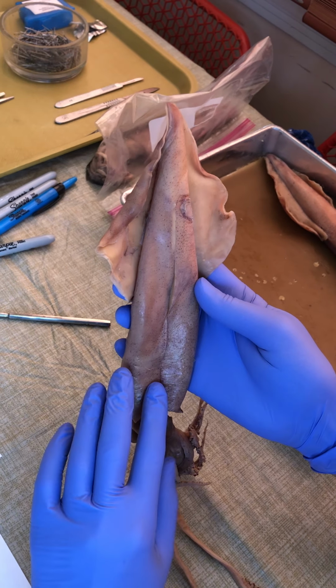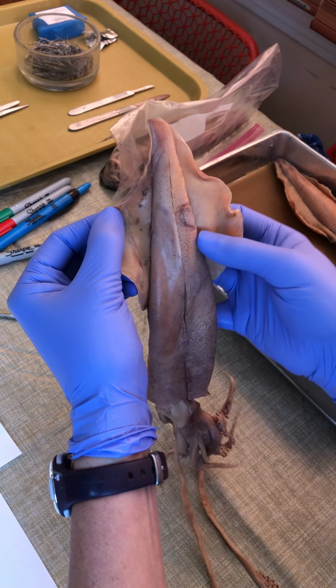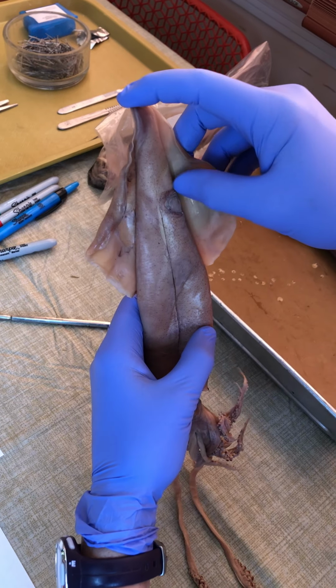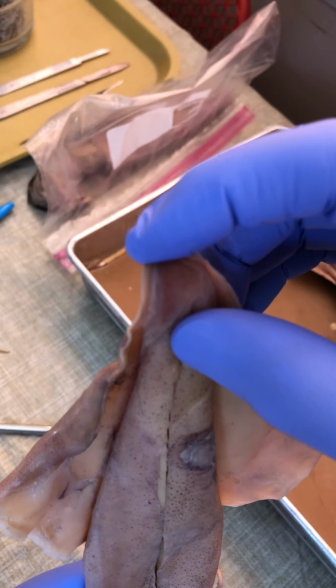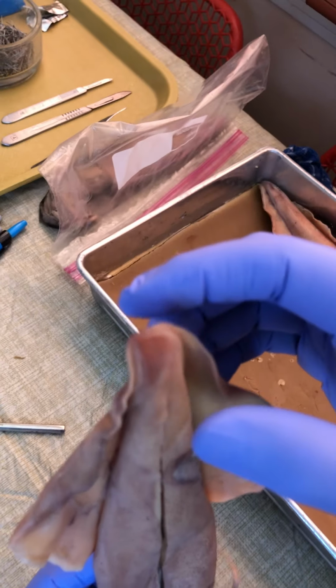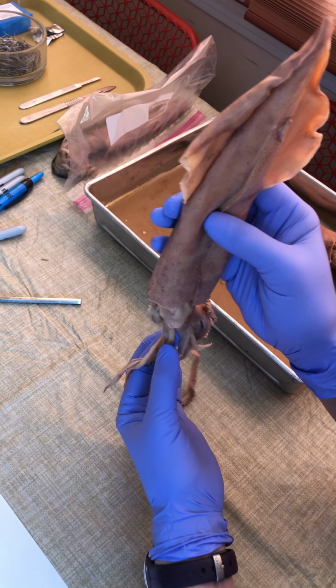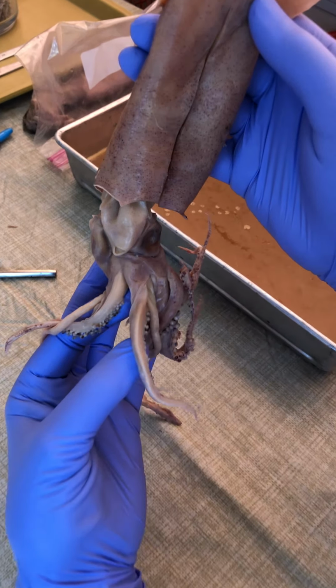So this is an unnatural incision, so just pretend like that's not there. And so this right here, these are the fins, okay? This tip right here is actually the dorsal surface. Okay, which means the ventral surface is going to be down here, around these arms and tentacles.